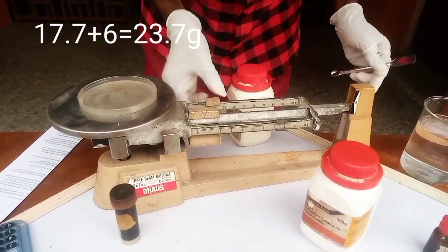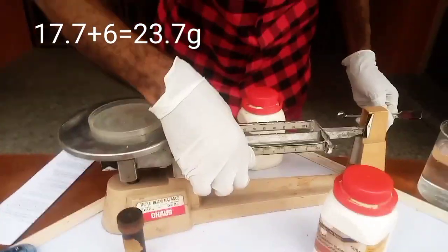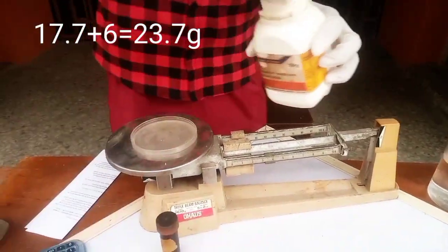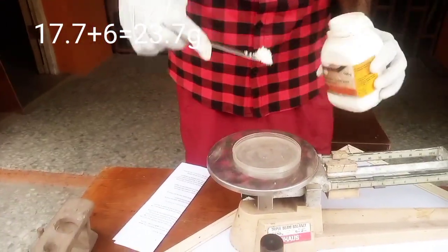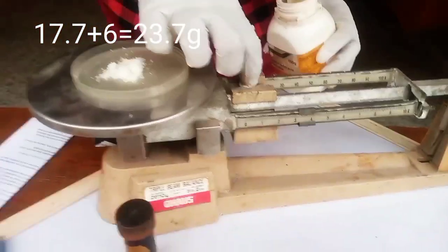Therefore I need to put it down in that 23.7. Okay, then I need to bring the potassium iodide down there and mix it up and get my accurate 6 gram. But remember, this is analog. Will not give it perfectly accurate.